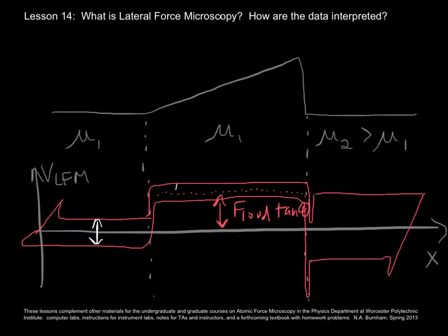this and this distance were the same. I wasn't quite successful, you see, but those distances are equal to twice the friction coefficient times the load with all of our approximations. And as you see here, the main point is that this is twice mu2 times the load, whereas over on the left, that is mu1.